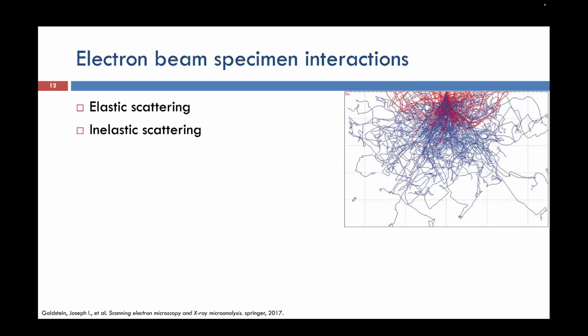So these are some of the modes that an SEM operator generally operates. Now we have decided what will be our Dp, what will be our Dmin, what will be our Imax. Now we want to see what will happen after interacting with the specimen. Why should we think that electron beam specimen interaction is important?